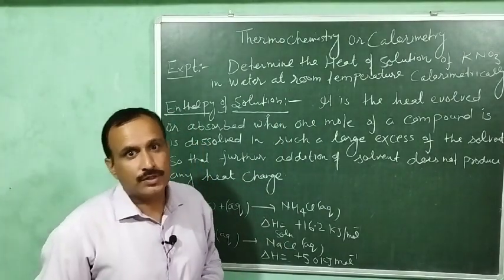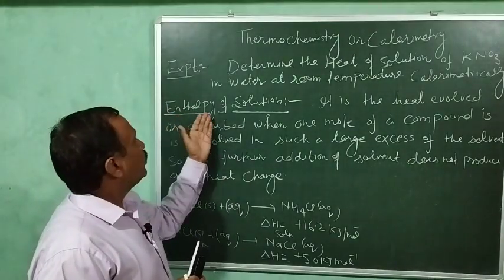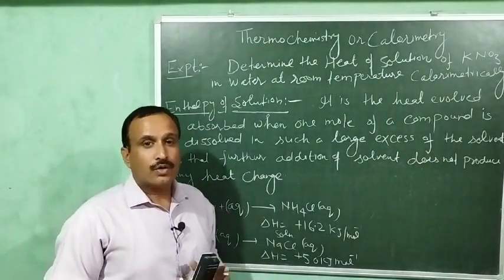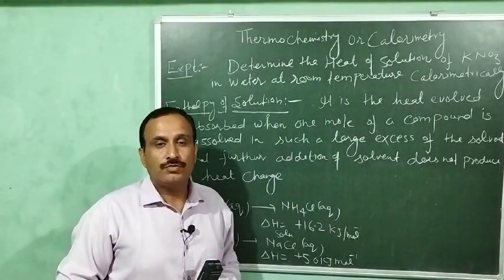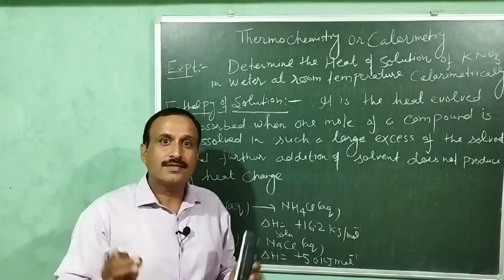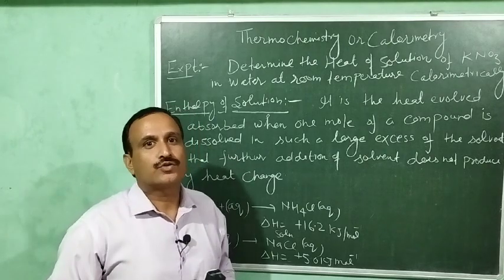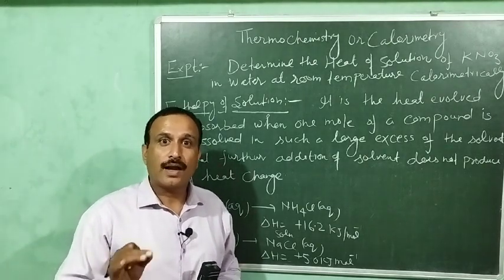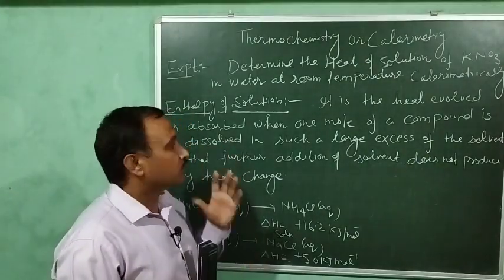But before coming on to this experiment, let us quickly define enthalpy of solution, or the heat of solution. It is the heat evolved or absorbed when 1 mole of a compound is dissolved in such a large excess of the solvent that further addition of the solvent does not produce any heat change. So this is the definition of enthalpy of solution.